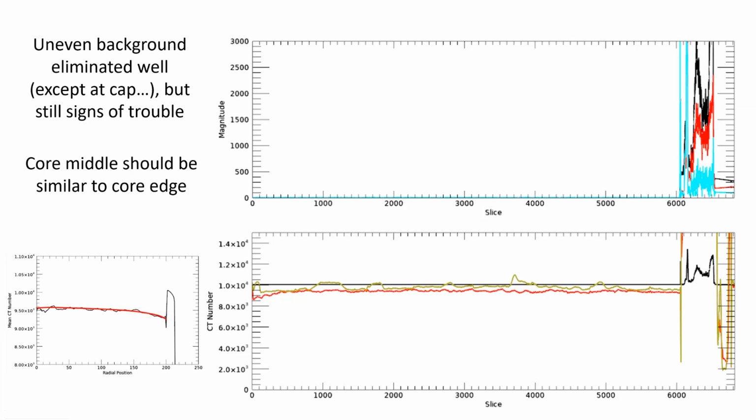And then if we look a little bit beyond the edge of the dirt, we can see that this actually continues off into the tube, and the inner part of the tube is a little bit brighter than the outer part of the tube. So that's actually continuing the same beam hardening error. In this case, the beam hardening correction we put on was a slight overcorrection, because normally beam hardening would be dark in the middle and bright on the outside.